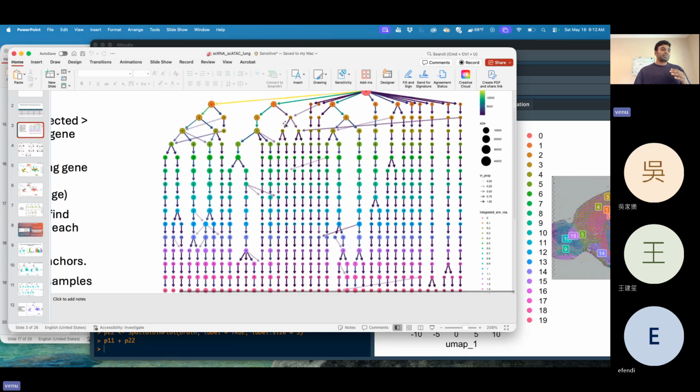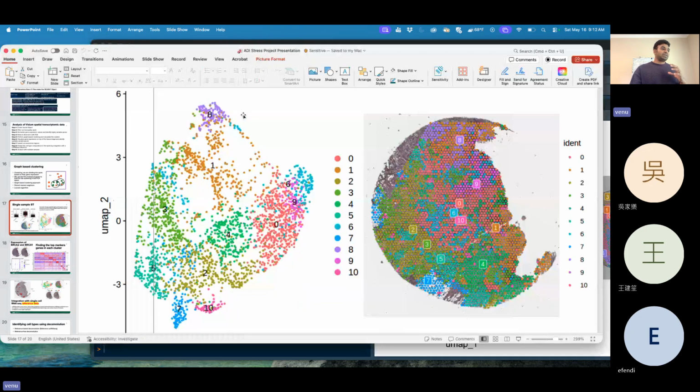For suppose I can say this is a CD4 cluster, so T cells. Again, T cells, we have CD4 cells. Because of the markers, it is split into two, CD4 and CD8. Again, CD8 cells have different markers, and again CD4 has different ones, like that. So we are diving into different subgroups. That is where clustering plays a key role.